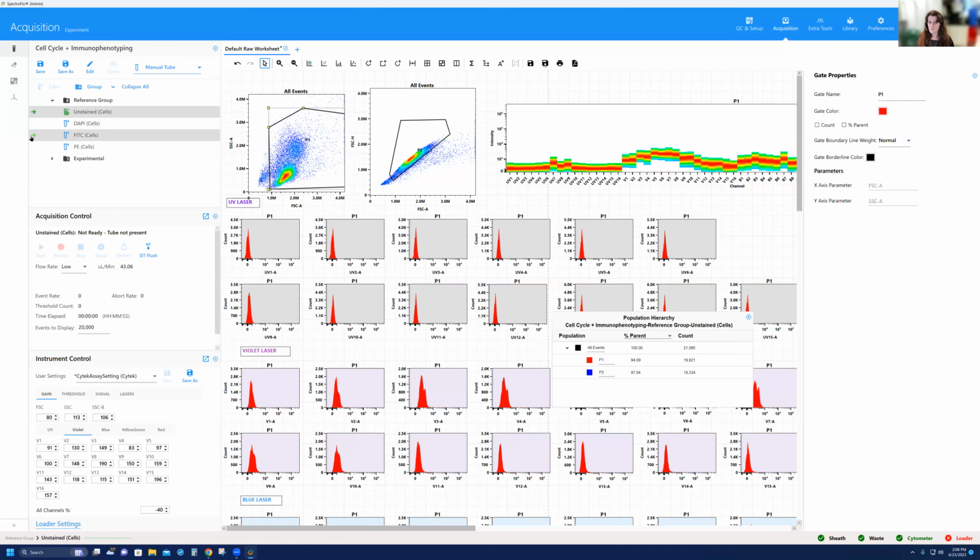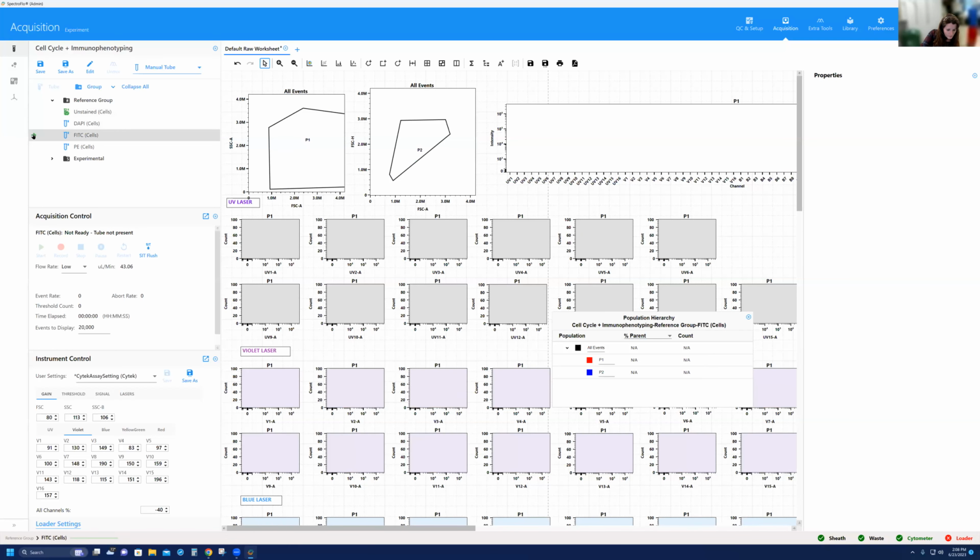And to save time for myself, I'm going to skip over that DAPI so that I don't have to run bleach and water again. And I'm going to go to FITC. Okay, and I see that there's another question in the Q&A. Is there something that we haven't covered just yet as I'm running these single colors? No problem. It's about fixation, so I'm typing an answer. Oh, perfect. Okay. All right.